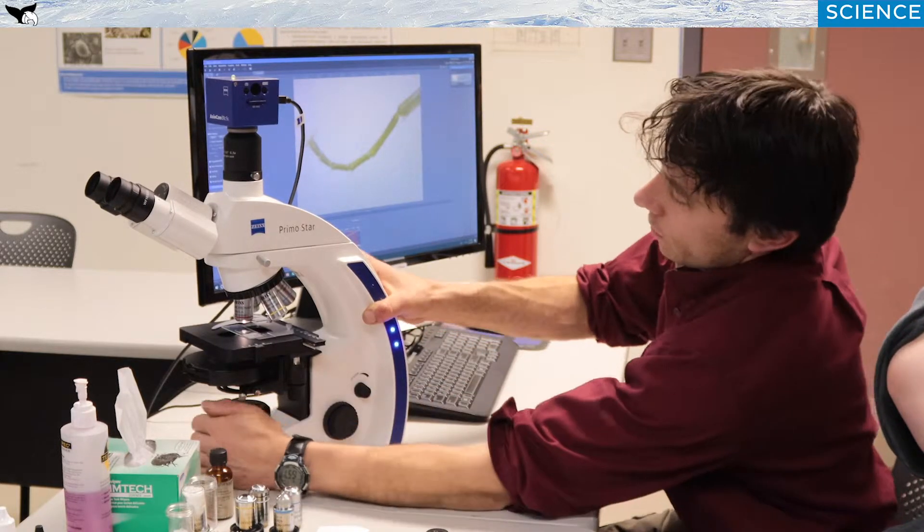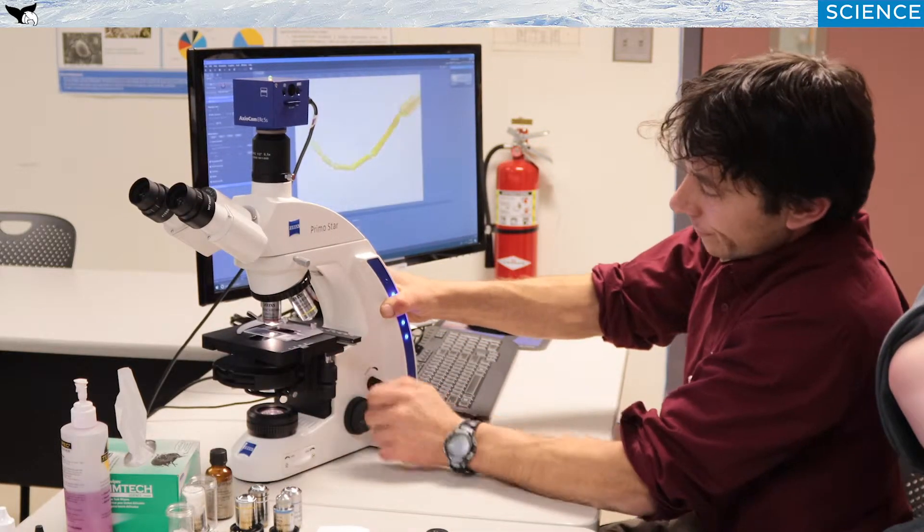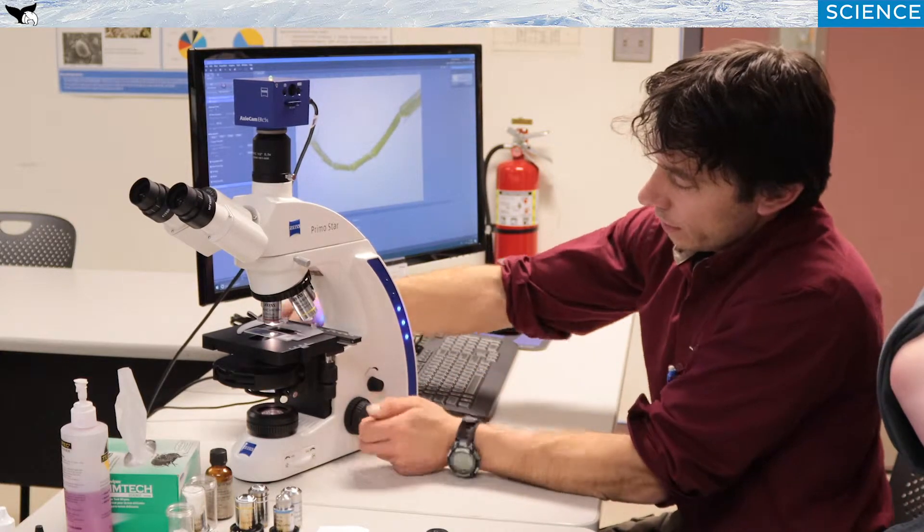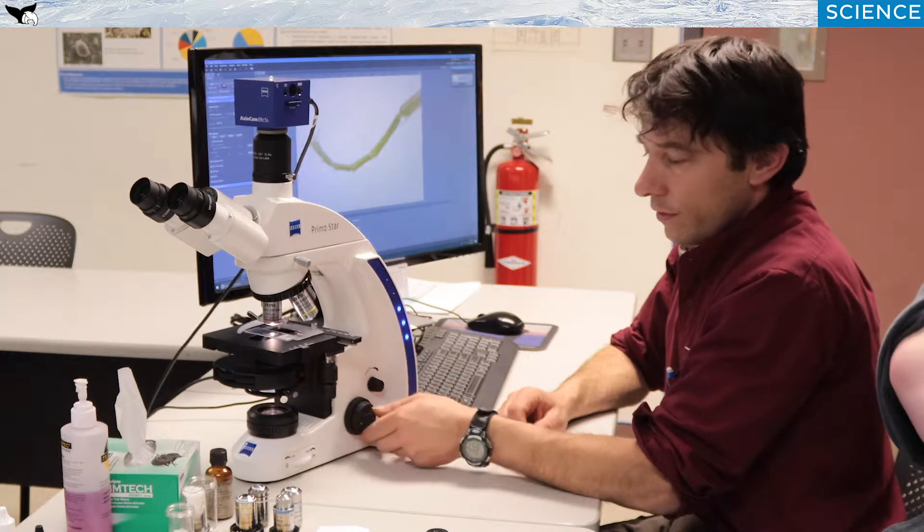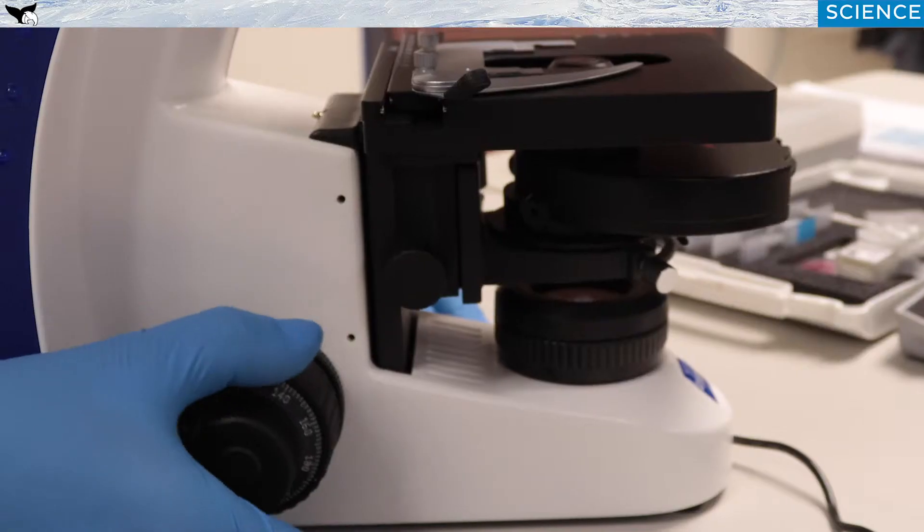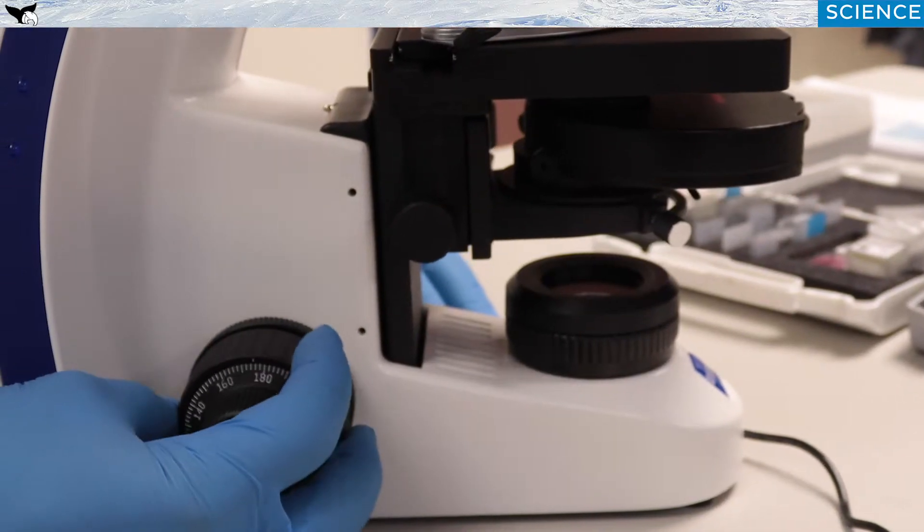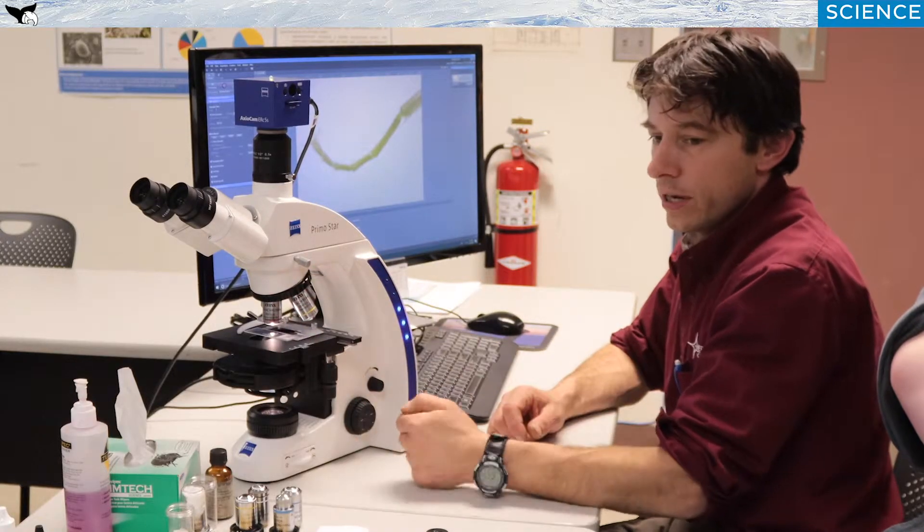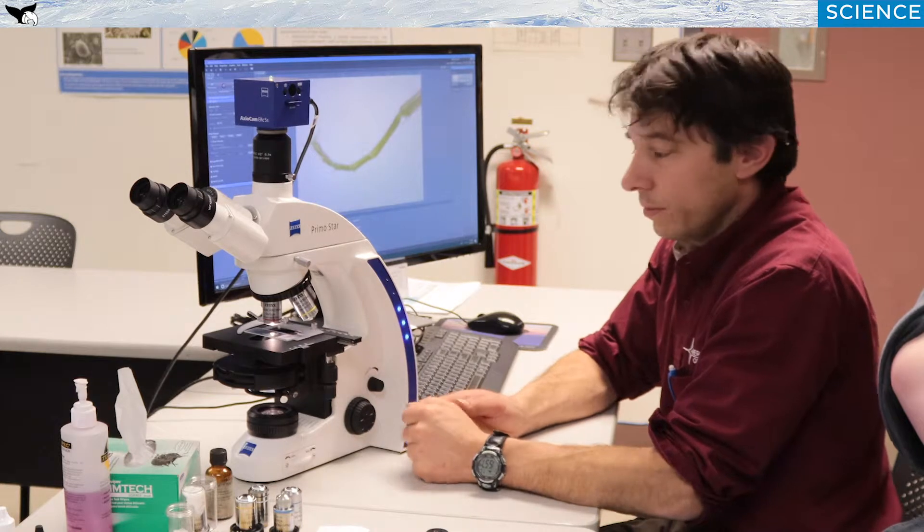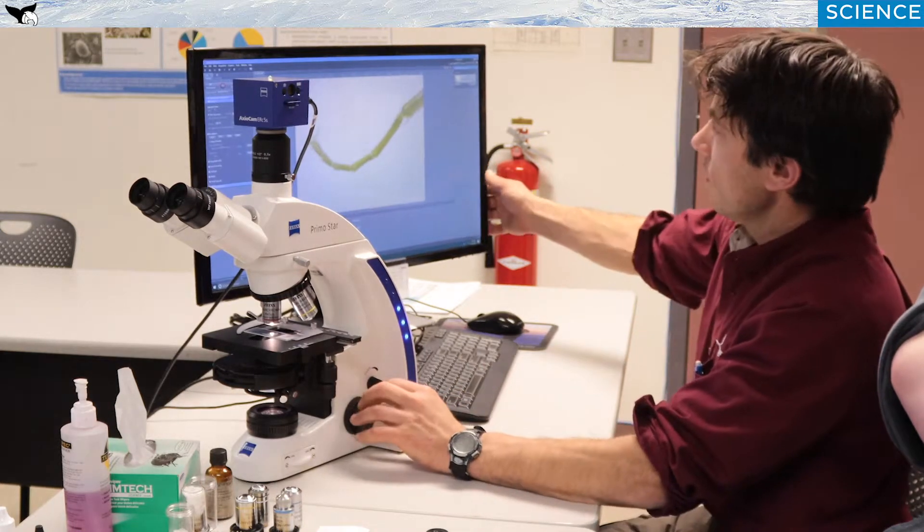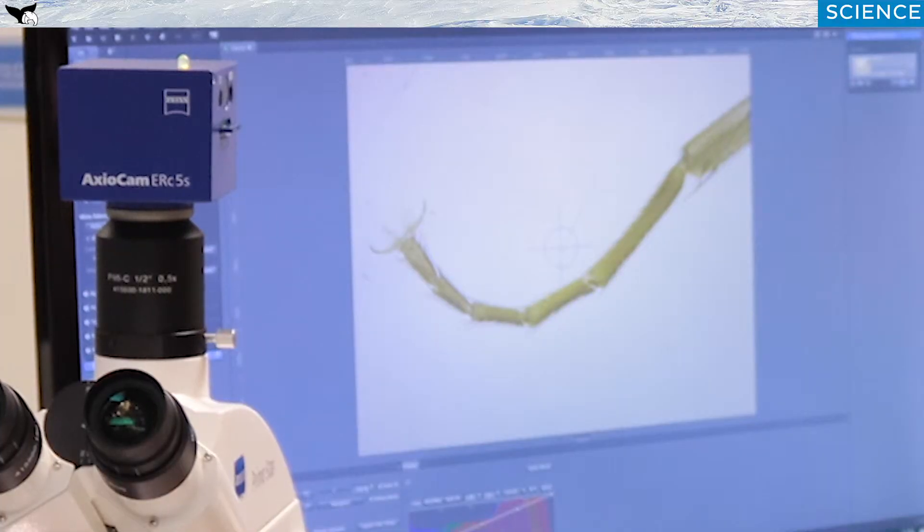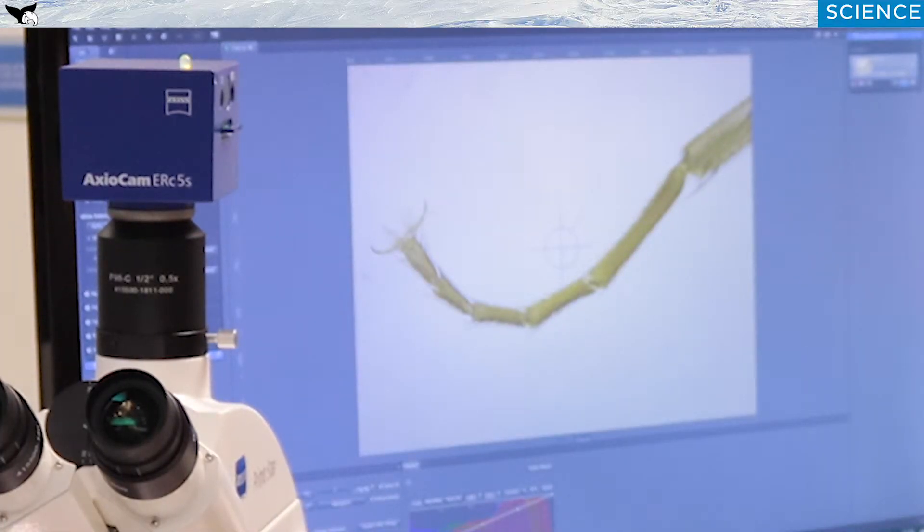So we have light switch on and off. And somewhere around in this area of the microscope, you're going to see a knob that rotates like this, and that is the focus control. It moves the stage up and down, which invariably moves your specimen closer or further away from the objective, and allows you to focus sharply on the specimen. And as you can see here, as I move it up and down, we can go in and out of focus.